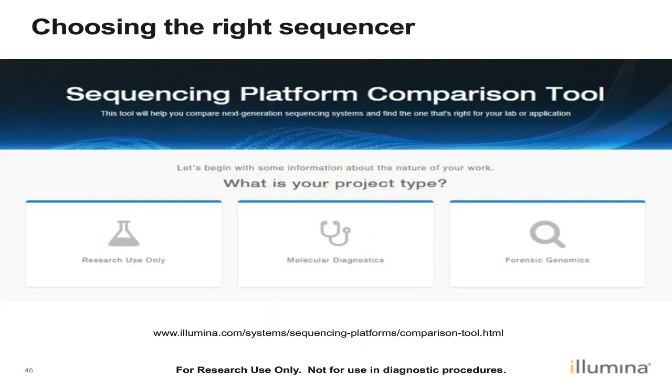We have a sequencing platform comparison tool, which is a helpful resource for deciding on the most appropriate sequencer for any project.